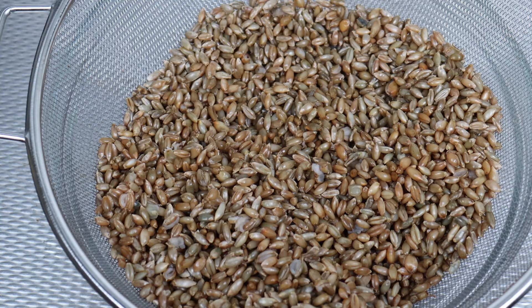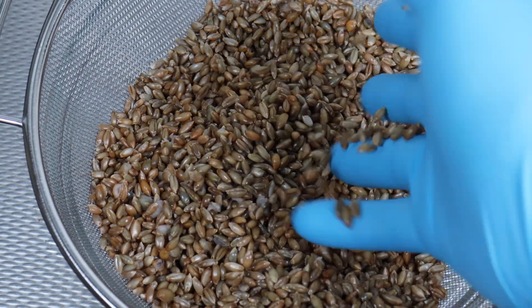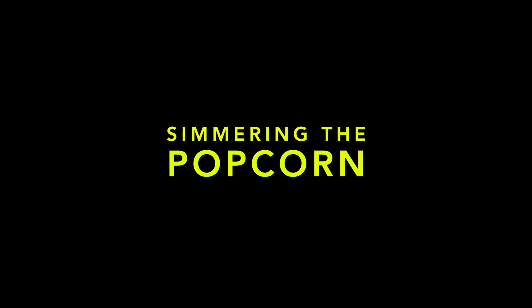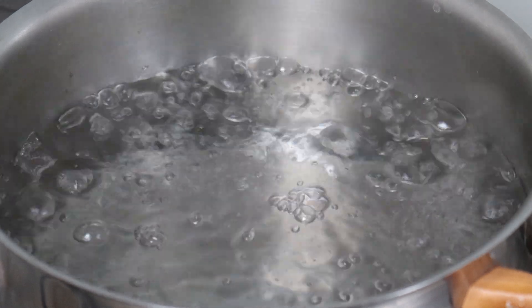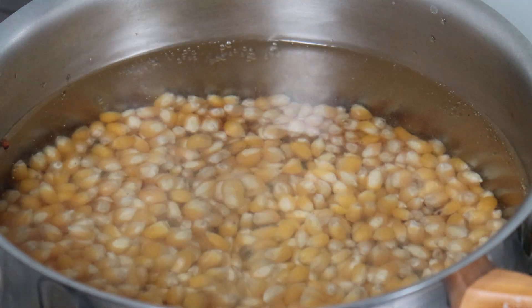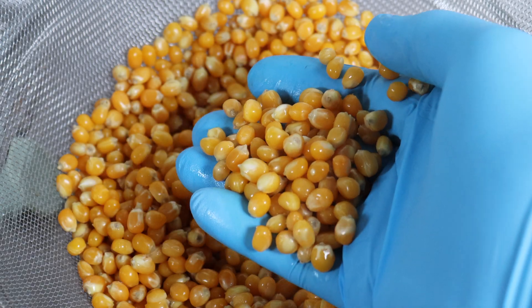I'll then let the grain dry for half an hour. And you're left with lovely grains like this, full of water, ready for the pressure cooker. Now to the popcorn. For this, I bring the water up to the boil once more, except I'm going to simmer the popcorn for about an hour. And then after an hour, I strain and let dry, like the rye.